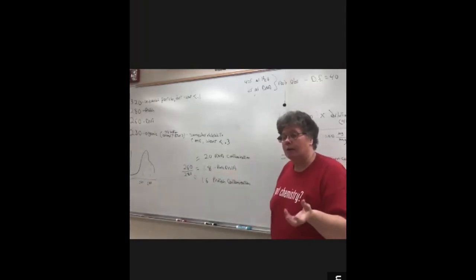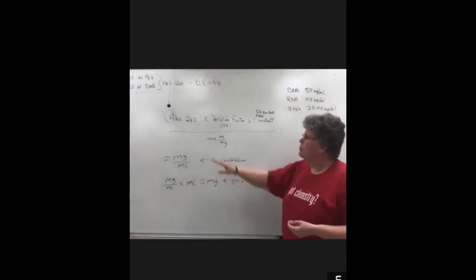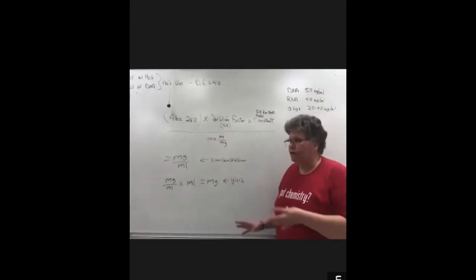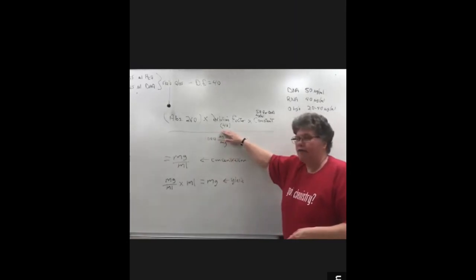Now you also want to be able to measure the yield of your DNA. And you're going to take the number that you get for your 260, the absorbance at 260, and you need to multiply it by the dilution factor to be able to get back to the original concentration that you had in the tube. But neither of these have units.